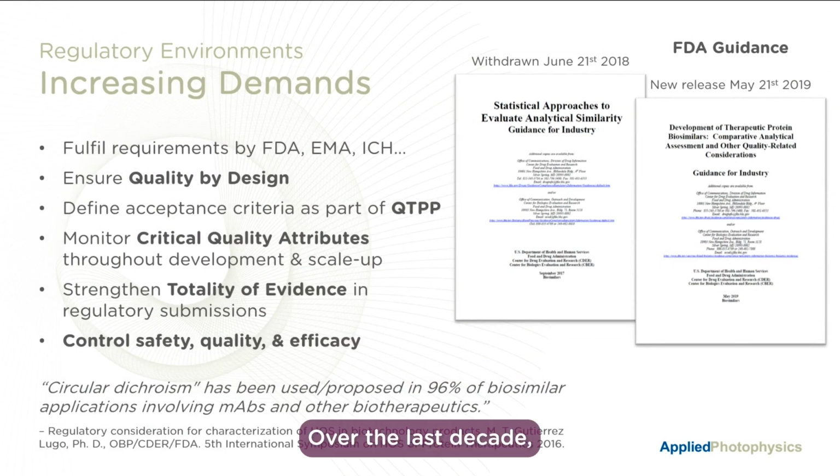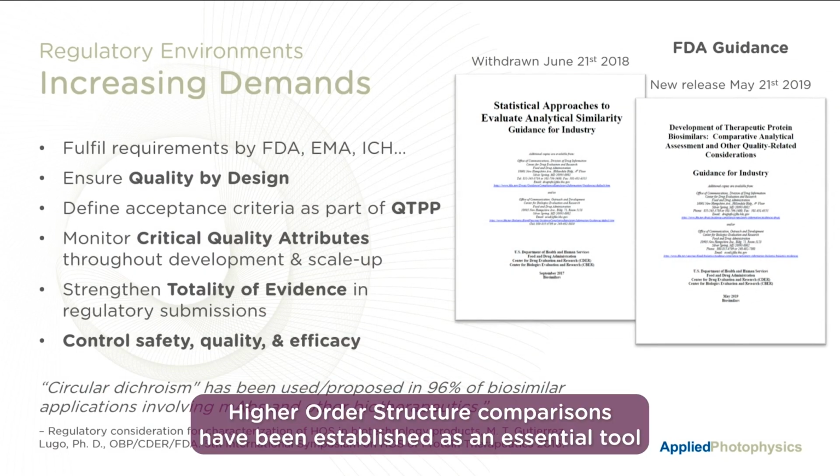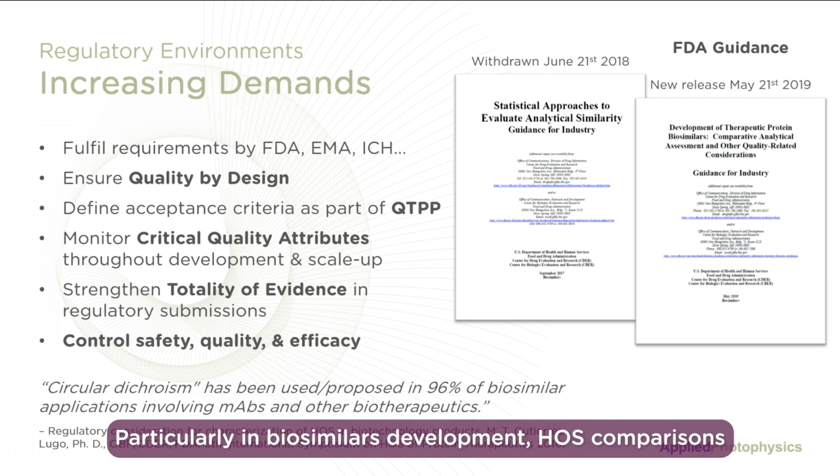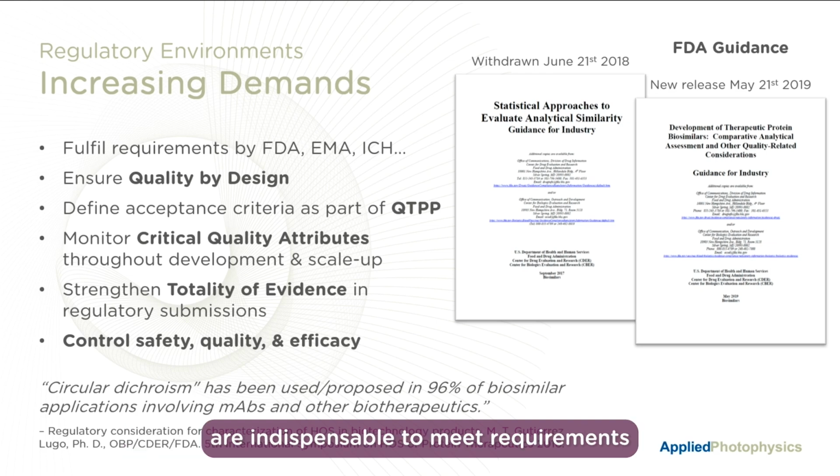Over the last decade, higher-order structure comparisons have been established as an essential tool to consolidate CD data and submissions for new biologics drug applications. Particularly in biosimilars development, HOS comparisons are indispensable to meet requirements by the FDA, EMA, and other regulatory bodies.